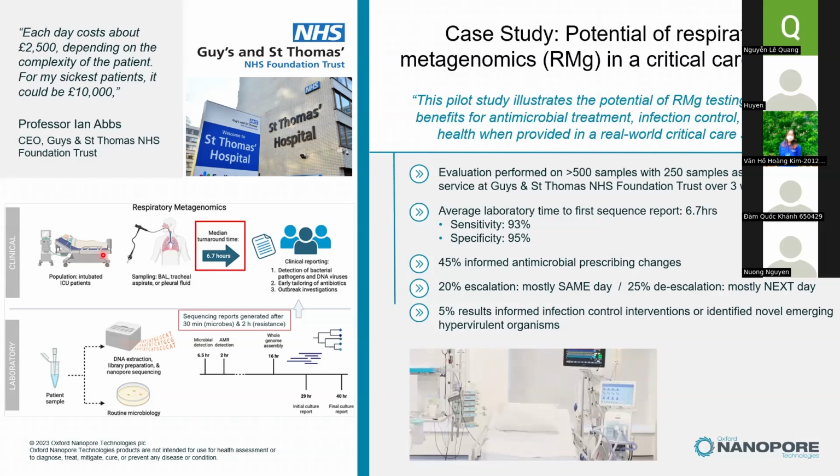So it is very subjective to answer how many samples to multiplex in a run, because it depends on the number of samples that you have, the coverage depth that you require, and the application as well. Yeah, thank you.